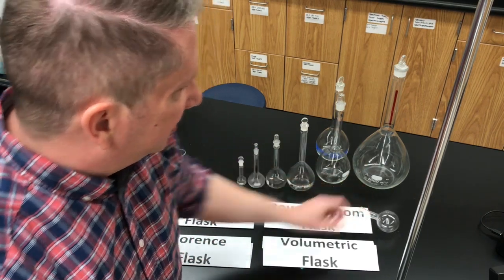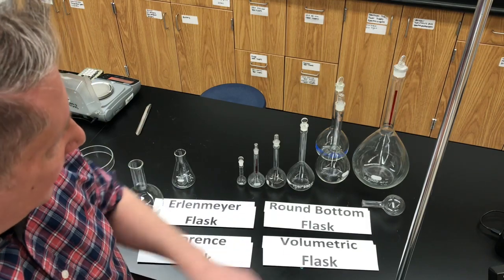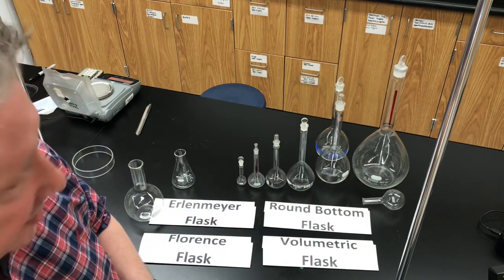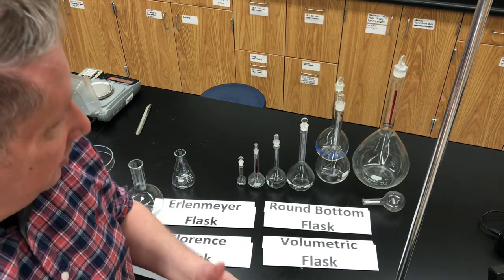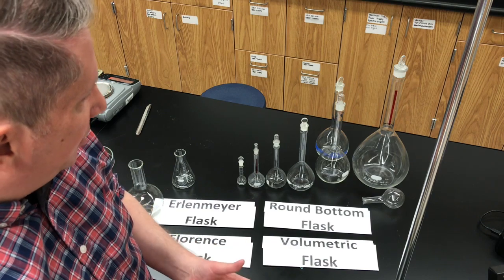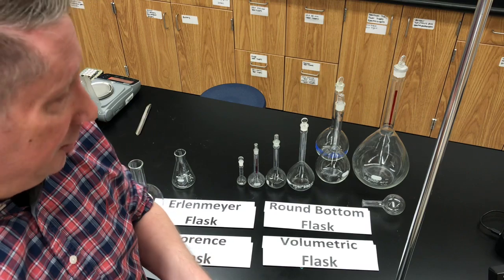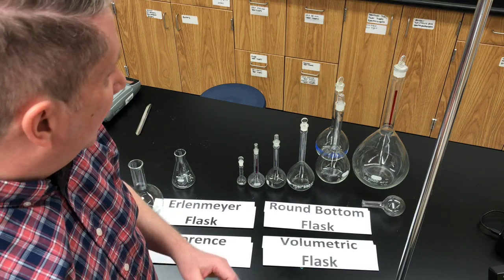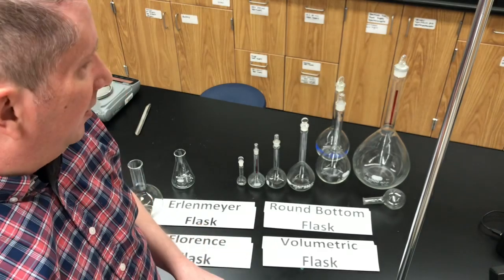And that brings us to the last type of flask we're going to see today: the volumetric flask. I've got several different sizes here in front of me. These volumetric flasks are the ones we use when we want to make a solution of a known concentration. These flasks are called volumetric because they measure volumes very, very accurately. In fact, each of these flasks is designed to measure just one volume.